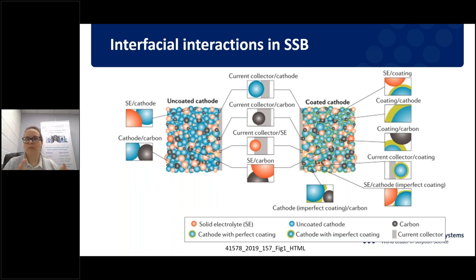So it's very, very complex, as also Johanna highlighted, and to really understand the effects and what's happening in the batteries, and also how these batteries can be improved and then also recycled, we have to measure and characterize them, and understand a bit more deeply the effects and what the temperature can cause on these samples.